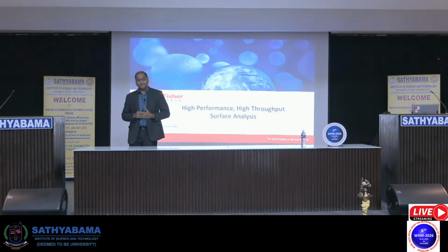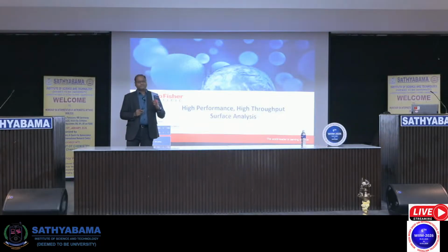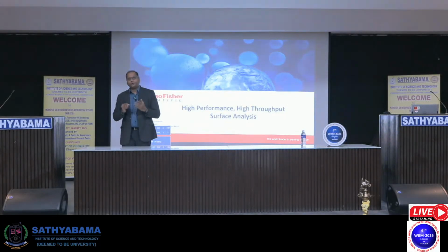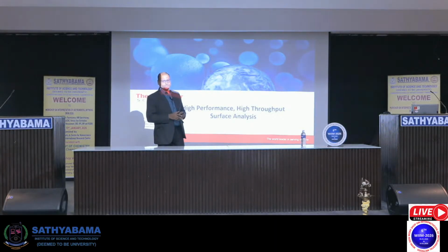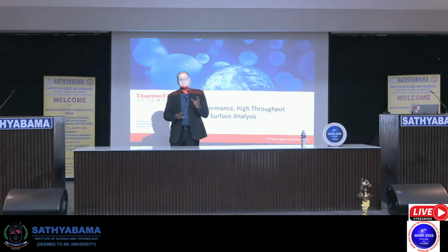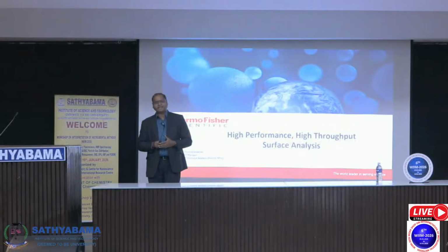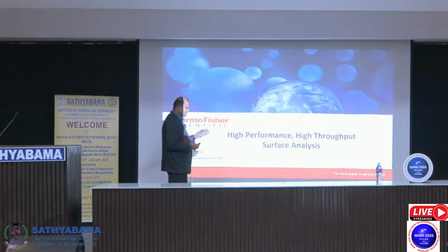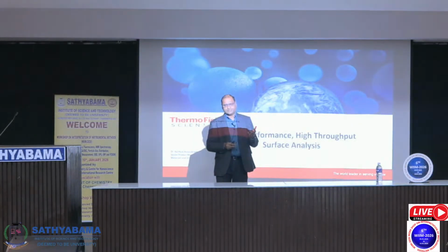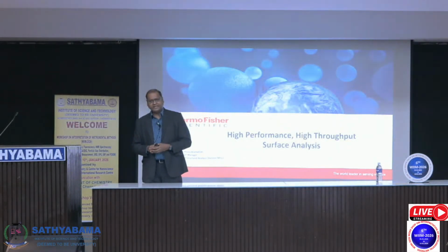But ever since the nanotechnology boom came up in the early 2000s, the importance of surface analysis has gone to unprecedented levels. Whatever might be the sample that you are working on, or whatever research area you might be working in, unless you characterize your samples with an XPS, your analytical characterization remains incomplete. That's the importance XPS plays in the modern age of materials, particularly with the improvement we have seen with these advanced and functional materials.